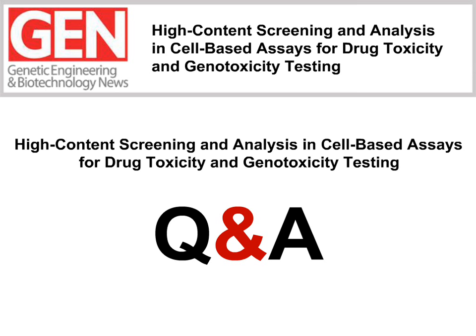Okay, thank you. Here's another one. Have you been using high content analysis to follow MSC differentiation? Very interesting question. Yes, actually, we follow the stem cell differentiation by normal microscopy, in particular for the adipogenic differentiation. What we do now is just to count the number of the droplets of fat that are forming in the cell.